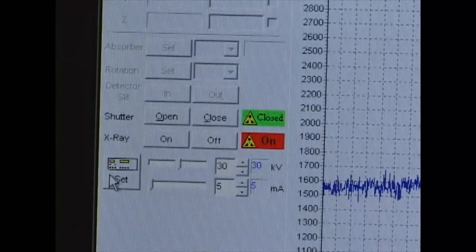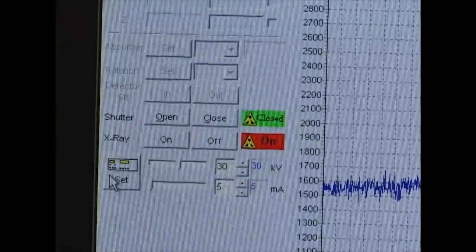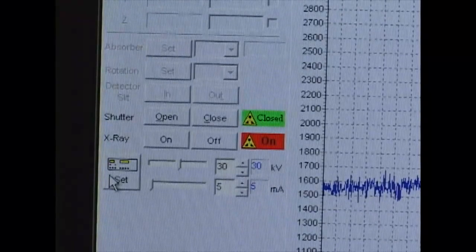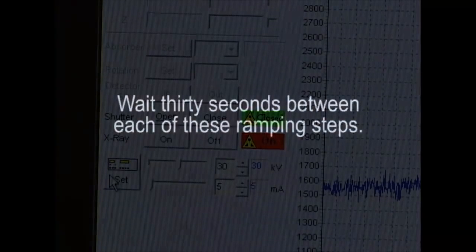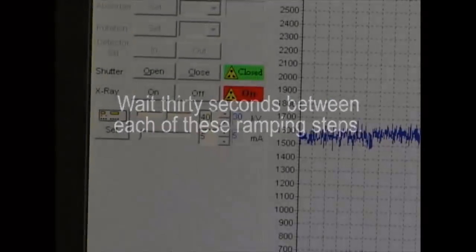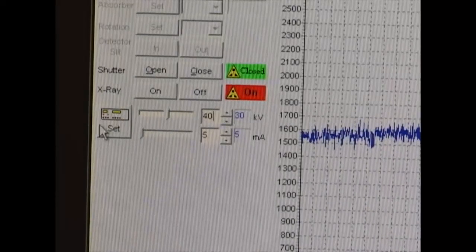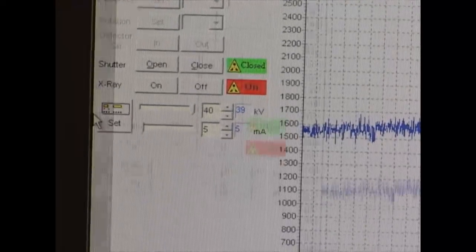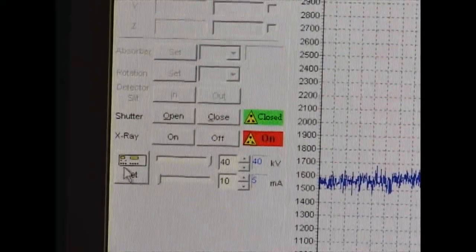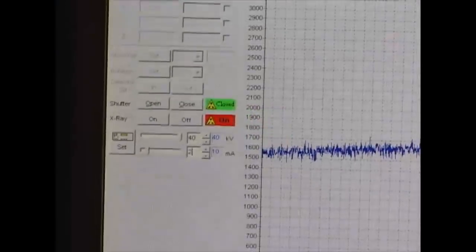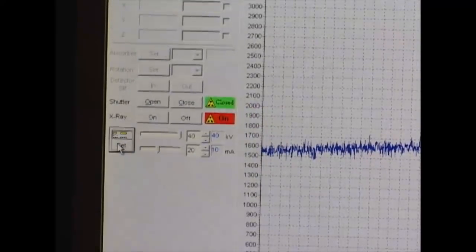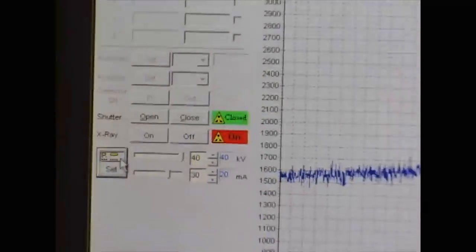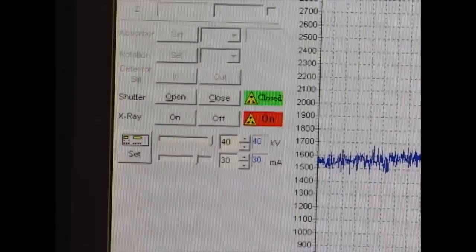Now, we want to wait approximately 30 seconds to a minute between each step to give it time to soak at that power. All right, so it's been about 30 seconds. So I'm going to go ahead and go to 40 kilovolts and 5 milliamps. All right, so it's been about 30 seconds. And I'm going to go ahead and ramp this up to 20. So now, let's go ahead up to 30 milliamps.